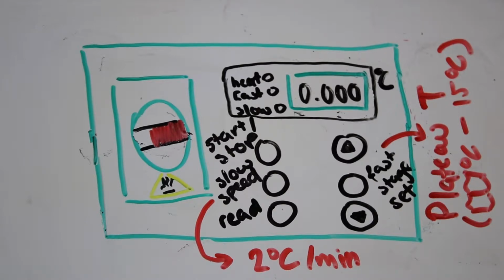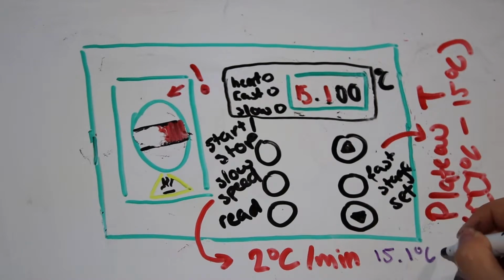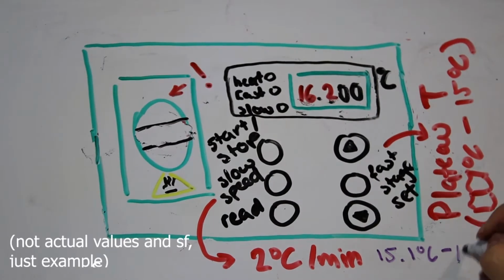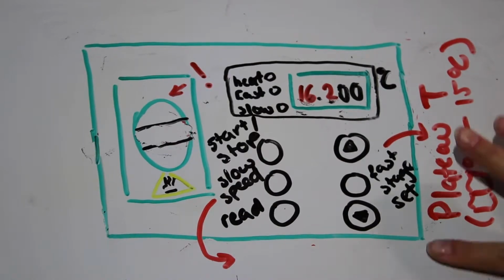The machine will now start heating slowly. It's up to you now to identify the melting point range, and note this down immediately once you've gotten it to stop you forgetting. And that's pretty much the gist.